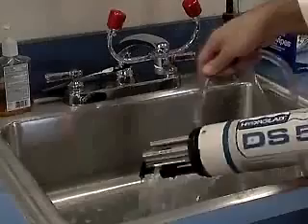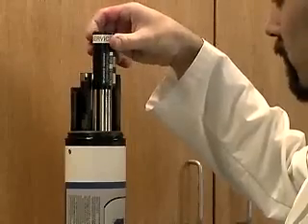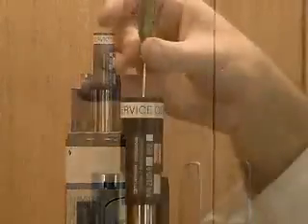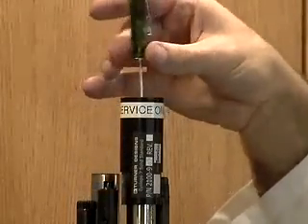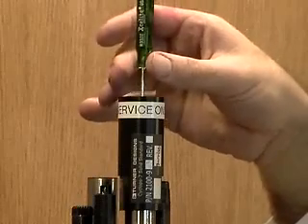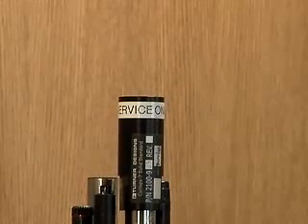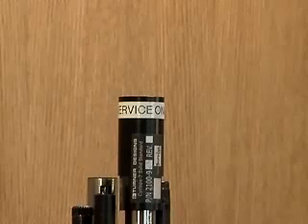If you are using the solid standard, rinse and dry the sensors and place the standard over the top of the fluorometer. Use the small screwdriver provided to adjust the standard until the micrograms per liter reading displayed in the Hydrolab window is the same as what was recorded for the sample. When the current value matches the recorded value, the top of the solid standard can be tightened so that it locks the standard to that value. When the results of the extraction are known, the chlorophyll A sensor is recalibrated using this value.